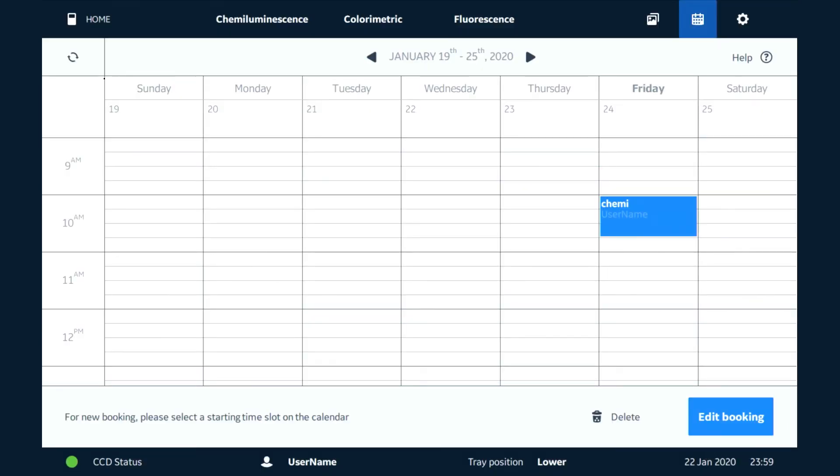Now back on this home screen here we can actually see who has created a booking and when they're actually going to be using the machine.